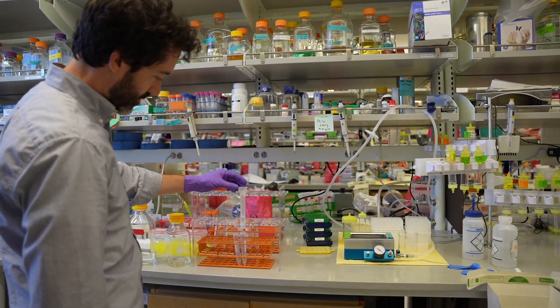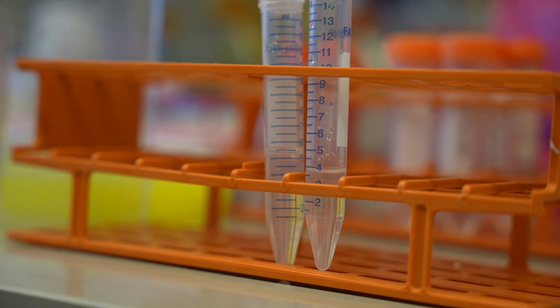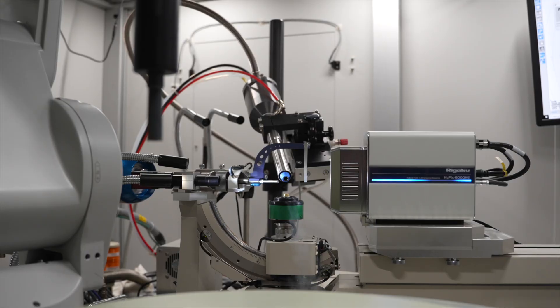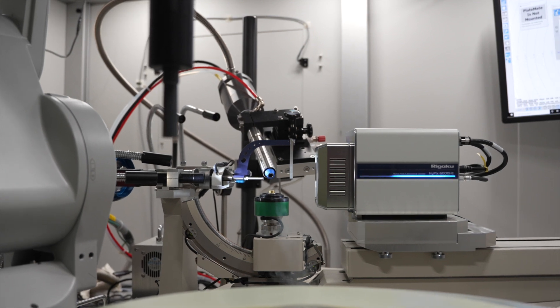There are all kinds of experiments we can do to study our sample of purified protein. We can probe the sample with polarized light to figure out if the protein is rigidly folded or if it's floppy in solution. We can pass the protein through porous gels to determine its size. We can also mix our protein with other proteins or small molecules to see if they interact. But today, we are going to talk about the most exciting experiment of all, solving a protein's structure. This is how we know whether the protein shape you designed in Foldit is actually achieved in the real world.